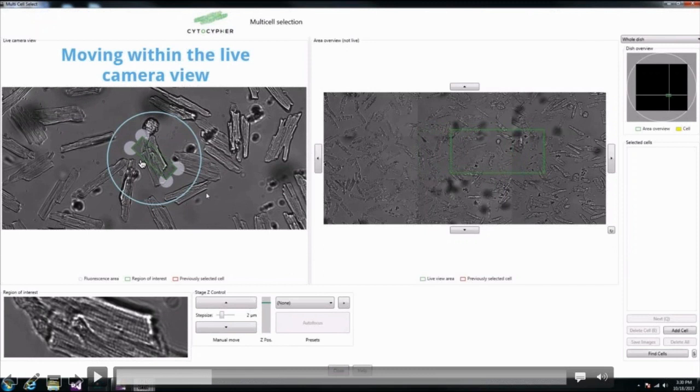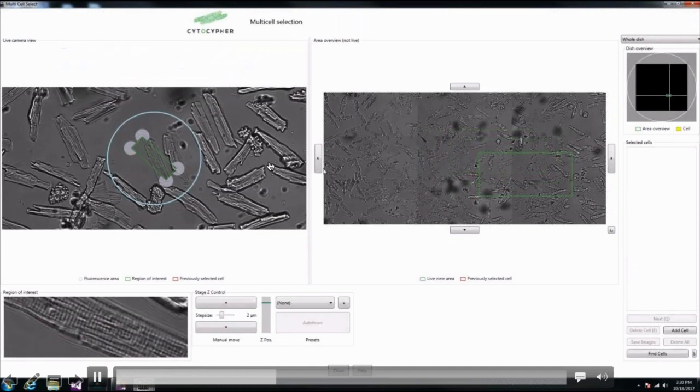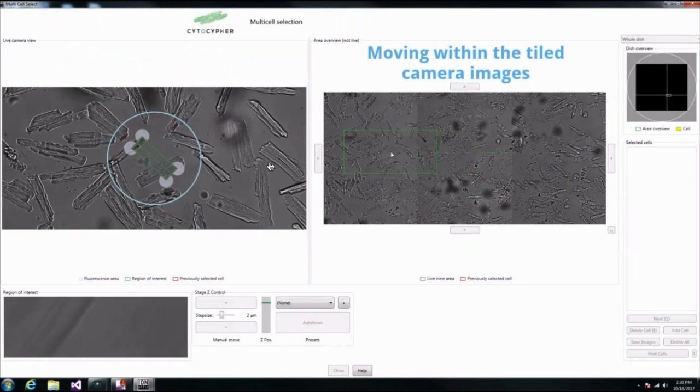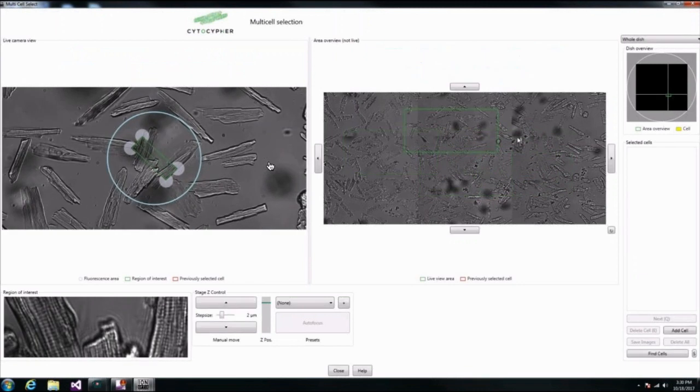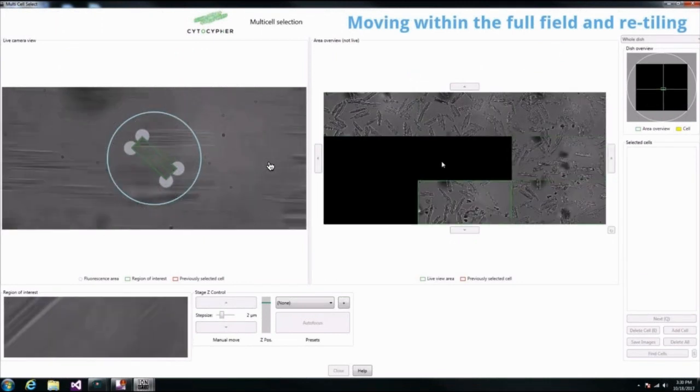So here you find the region where the cell will be, and then we can click around this window to go to different cells. We can click around in the overview if we want to go to a different part of the dish. This is the overview of the whole field of view that we have. So this is about the area where you can see cells in the 35 millimeter dish. We can click in this dish and we'll retile this image in a new position. So you click on it and you see how rapidly it moves to different positions. You have a good overview, you can see where the cells are, which is not a problem in this case because we have plenty of cells. But if you have sparsely populated cells, you have to find them. So you need a way to get an overview, so you can find the cells that are there.